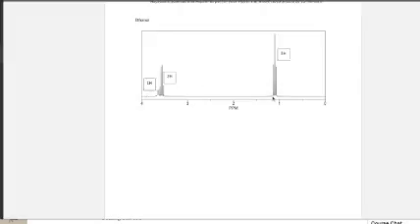So anyways, what I was saying, the reason why the CH3 and CH2 are such different spots is because usually CH3 is around 0.9 and CH2 is usually 1.2, but it can increase based on what it is bonded to. Due to that, it is going to be further up the chart and more over here. Therefore, this is going to give us the structure of ethanol, which I mentioned is a CH3, CH2, and an alcohol. So that is how we can interpret proton NMR based on this example.